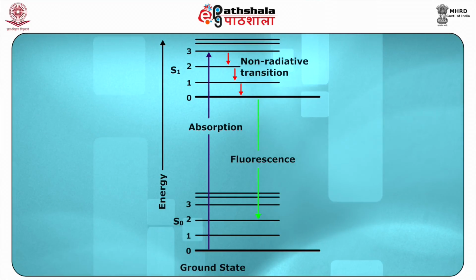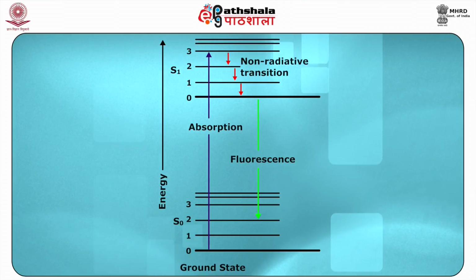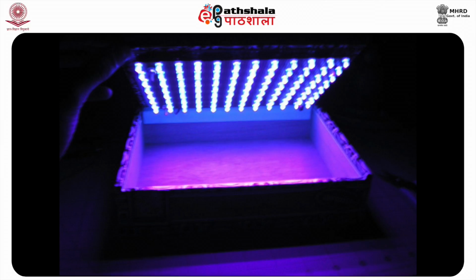For example, an invisible small stain of semen, when exposed to ultraviolet radiation from a UV lamp, gives a whitish blue color glow. Similarly, we can carry out examination of many other common articles of physical evidence, namely comparison of paper, currency notes, secret writing, sealing waxes, glass, threads, anthracene powder, and urine stains.